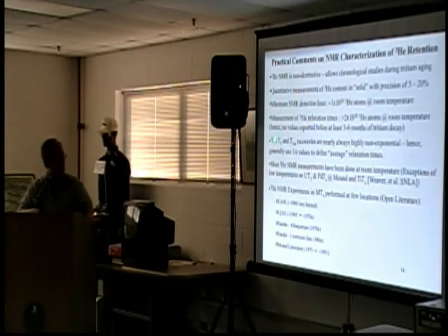What we would do is measure the relaxation time. They were generally non-exponential, so we would take the average value using the 1/e exponential time constant to represent the average data. Most of the helium-3 measurements we did were at room temperature. We did low temperature measurements on uranium tritide and some palladium tritide here at Mound. Harry Weaver at Sandia Albuquerque did some fairly extensive variable temperature measurements on titanium tritide. But in principle, it could be done with others, but they weren't necessarily the intent or the availability of time or samples to do that.